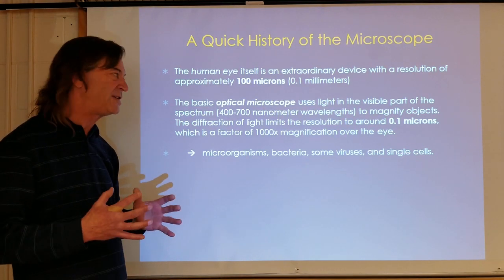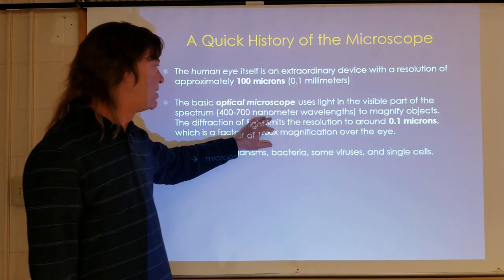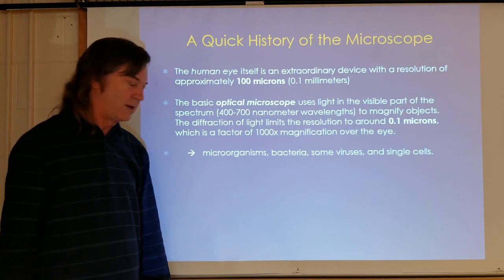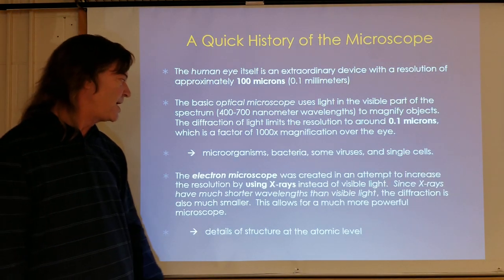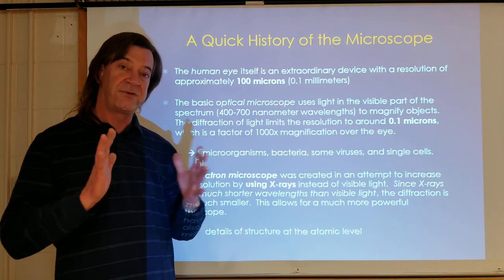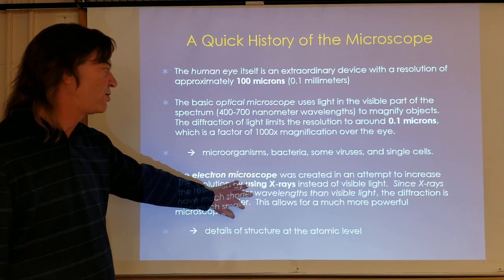But there are limitations, because obviously we're using our eyes, we're using the visible spectrum. And 400 to 700 nanometers is going to limit how much we can zoom in accurately. Now, as far as electron microscopes, well, they actually use X-rays, and we know that X-rays are high energy. They are very, very short wavelengths, and because the wavelengths are shorter, we can actually go down and get more resolution. And that one's about 0.01 microns maximum.